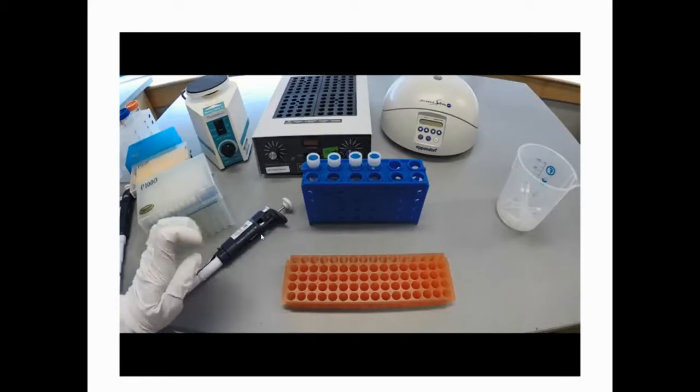The pipette is a very important tool, because in the molecular lab, for everything that you process, all the samples, you always need to use a pipette. So we have one simulation to show you how to use the micropipette. This is extremely important, because if you don't know how to use it or you use it incorrectly, then you will not be able to get the result.